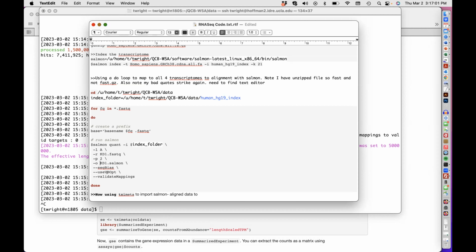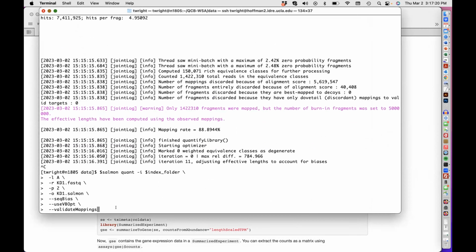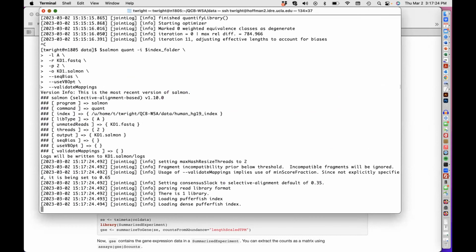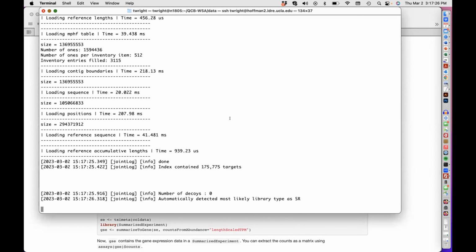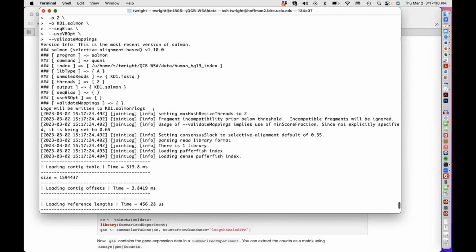And then only run that part, the one just before; you don't need the done. Just that part right there. Just run that part and then you'll just have KD1 done, at least. Let's take a look if that runs properly. Okay, at least we're writing to. Okay, cool. We should be good to go.